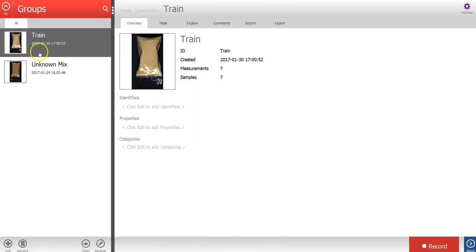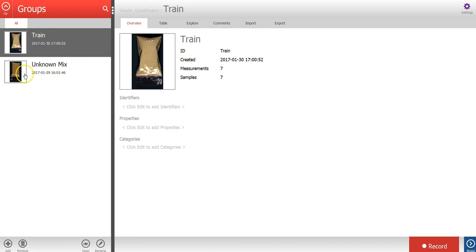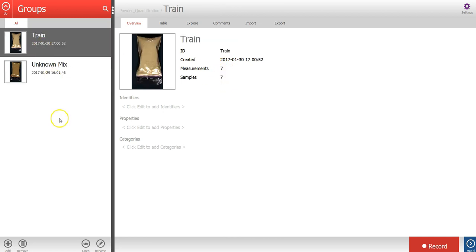The image data in the study is organized into two groups called train, including seven images, and a group called unknown mix containing three unknown samples. Let's open the train group.